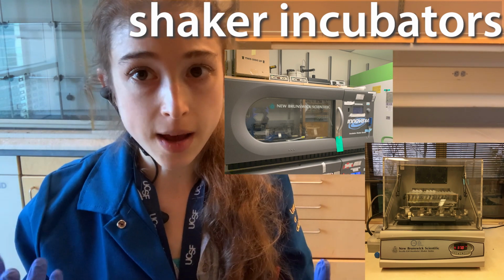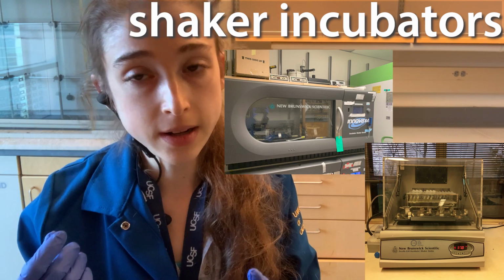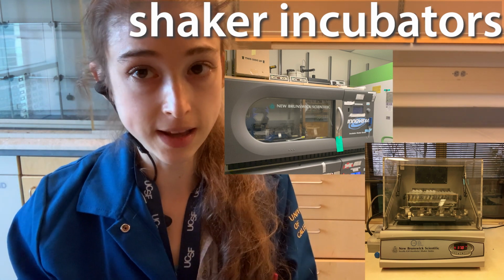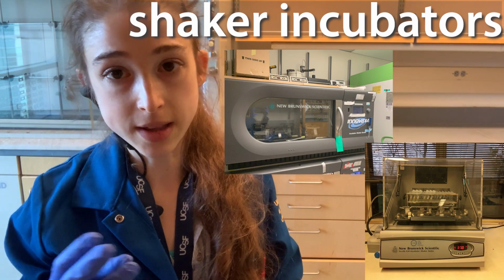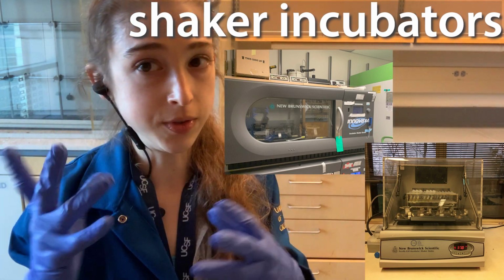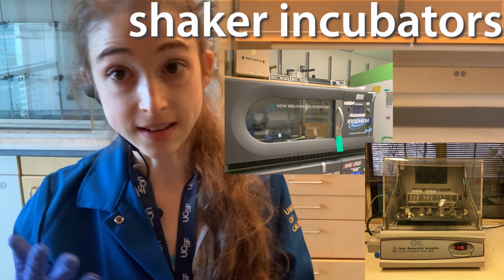But once we're scaling up the cell culture in suspension cells, where you have cells growing in liquid, we need something that is going to allow us to incubate bigger volumes and still shake them. And so we get these shaker incubators. They come in different sizes. Some of them are small. They have racks, and often these are removable, so you can put in racks for, say, 5 ml tubes, 50 ml tubes, or big flasks. And then they'll shake and incubate.